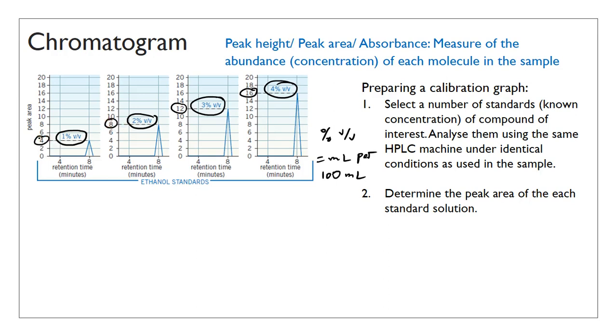These are going to be the point coordinates for your graph. Concentration is going to be the independent variable, and peak area is going to be the dependent variable. You actually can't see me, but I'm doing a dependent dance right now. So there are 4 points. The first one is 1, 4: concentration of 1, area 4. The second is 2, 8. Now this is a hypothetical situation. In reality, you're probably not going to have a perfect linear relationship. So 3, 12 and 4, 16.